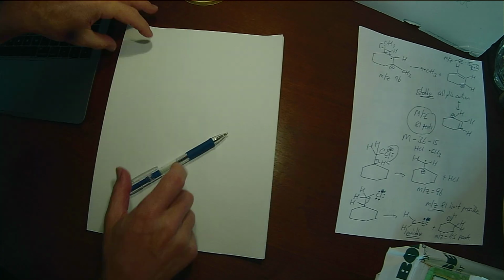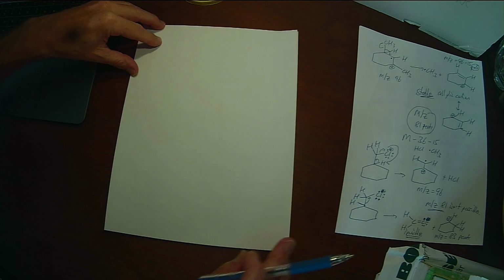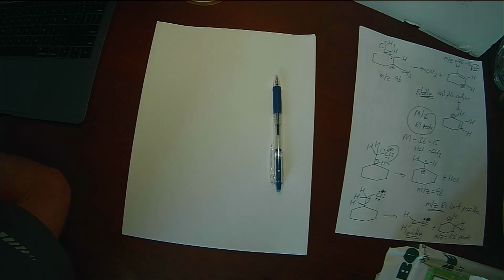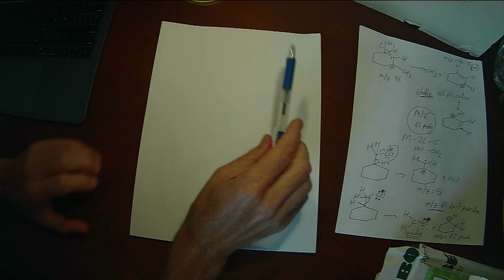Right. So in your notebook and in your report, you're going to want to use the mass spec as your method for identifying which is the primary. But then if you look at the boiling points, I think it's also consistent with the boiling points, right? You can't use the boiling points distinctively for all of them because you only have the boiling point for 3 substances. But I think you saw that the primary had the highest boiling point, which would also be consistent with it having the longest retention time. So peak 7 is almost certainly the primary.